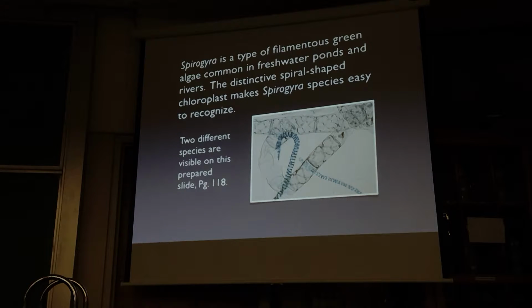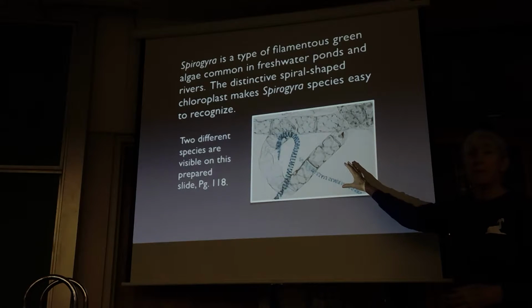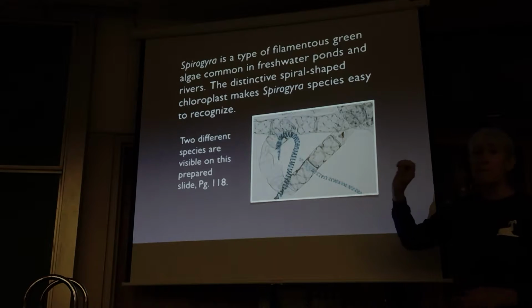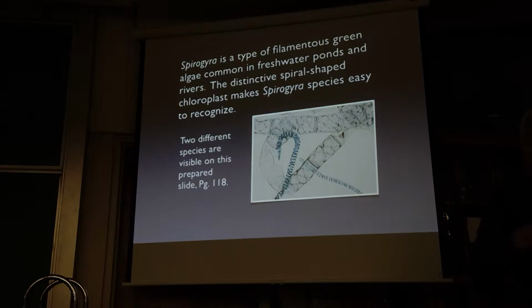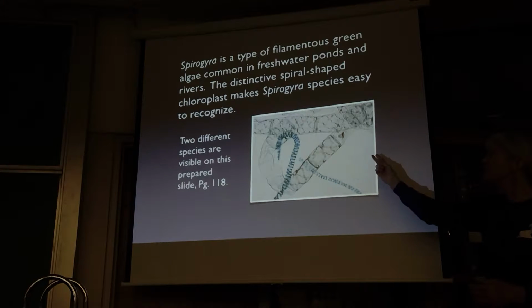So when you're showing us these prepared slides, are these our actual slides? These are pictures taken from our actual prepared slides. So this is something we'd actually see, like on a test? Yes. In fact, the images that are on the website are from the slides that I have in a box at home that says test slides. So they look very much like the pictures because they were used for the pictures. And the slide that I have has 2 different types of Spirogyra.